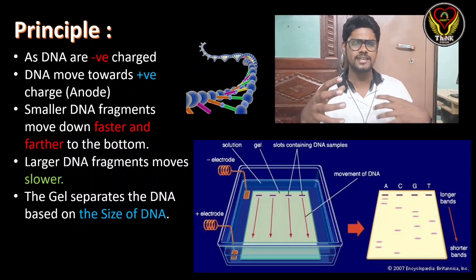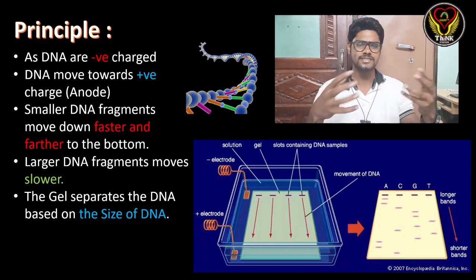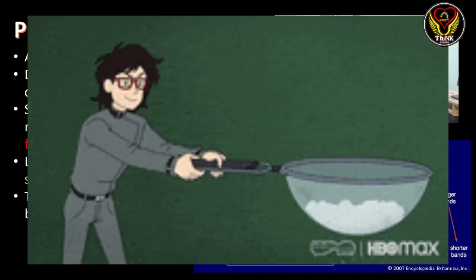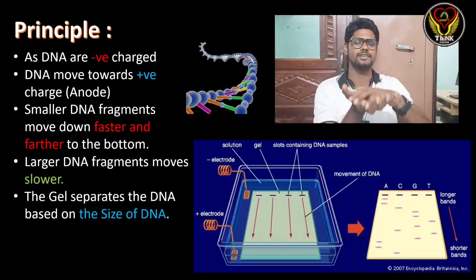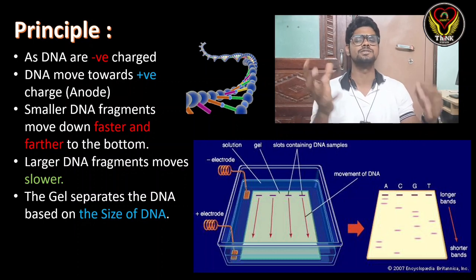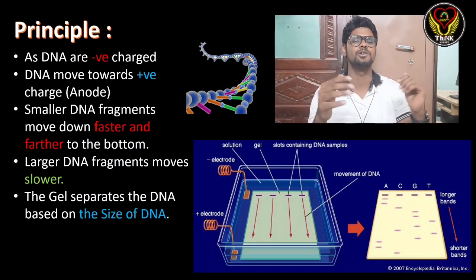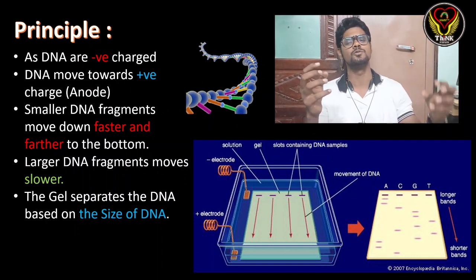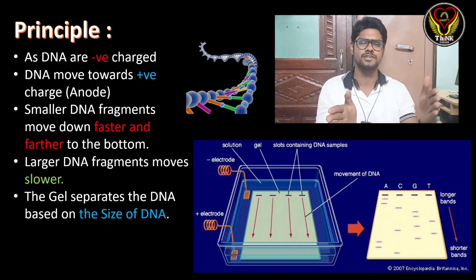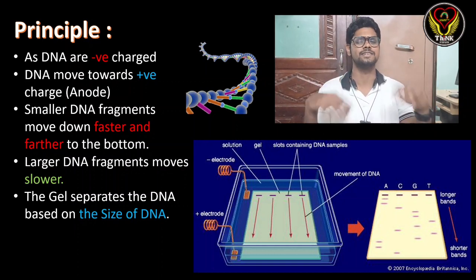Inside a gel, there will be a matrix-like appearance, like a net or a sieve. In a sieve, what will happen? Smaller things will go through and come out, but larger molecules will stay in the sieve. In the same way, larger DNA molecules will be stuck inside this matrix and will move very slowly. But the smaller molecules will move faster, and by this we separate the larger DNA molecules from the smaller DNA molecules. This is the basic separation principle of AGE.